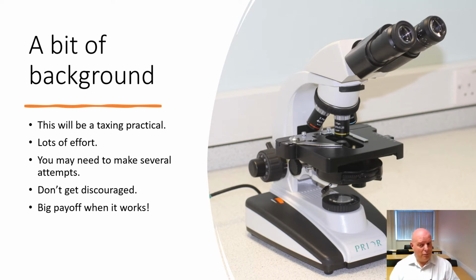I'm not going to lie to you, this will be a taxing practical, not because it's particularly difficult to actually create the preparations, but because it is a matter of numbers before you get preparations with the chromosomes at a state that they're actually useful. So it might take a lot of effort.